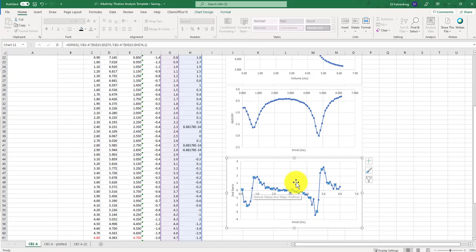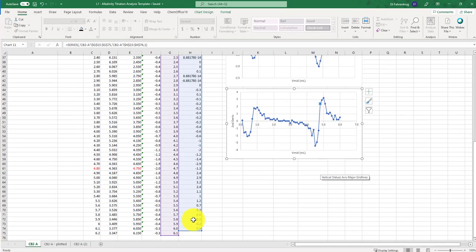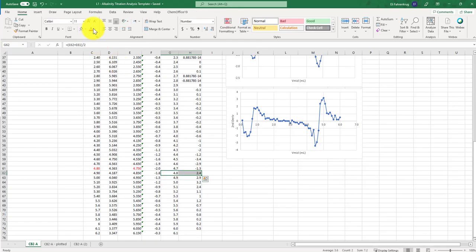And notice what we're seeing here again is the slope of this plot, so the change in this plot as a function of that volume. Just as we mentioned before, we see an initial negative slope, and then we see this change to a positive slope, which corresponds to this inflection point in the first derivative plot. And so where it intercepts that x-axis, that is a good estimate of that first equivalence volume. Similarly, we can do that at this second equivalence volume. One handy thing for these second derivatives is, in order to estimate where that intercept is, what I can do is just look at a simple plot of the two points that span that x-axis. So if I look here, hold this, I can find that's at the 4.8, 2.4 point. So I can go down here and find the 4.8, 2.4, and I can make that.